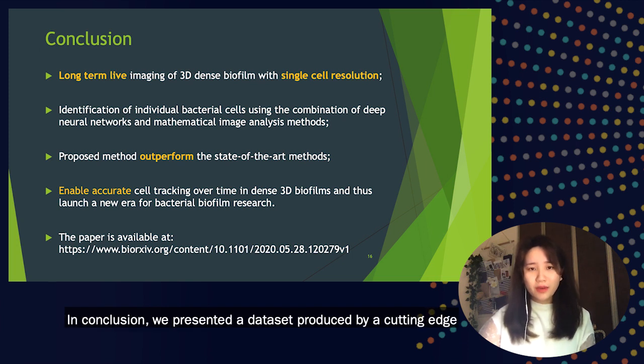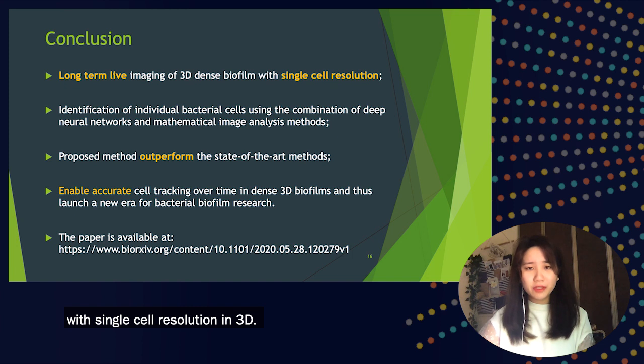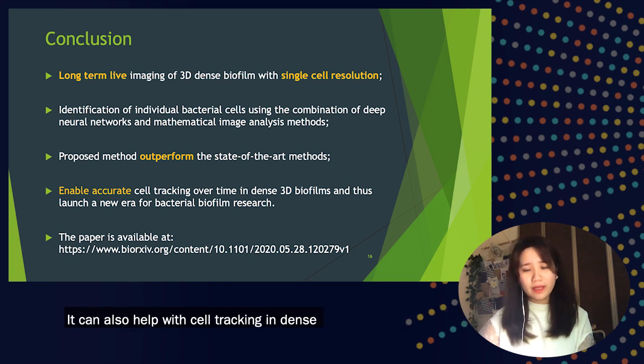In conclusion, we presented a dataset produced by a cutting-edge imaging technique that is able to perform long-term live cell imaging with single-cell resolution in 3D. We also introduced our proposed image analysis workflow for this dataset, which can consistently outperform the other methods. It can also help with cell tracking in dense 3D biofilms for future work. You can find more details about our work on bioRxiv.